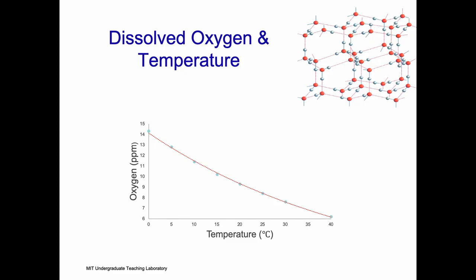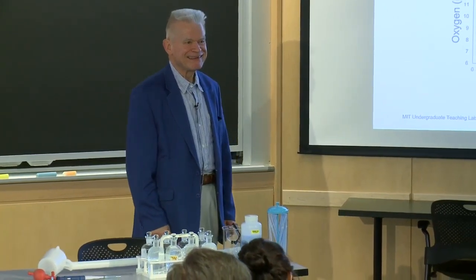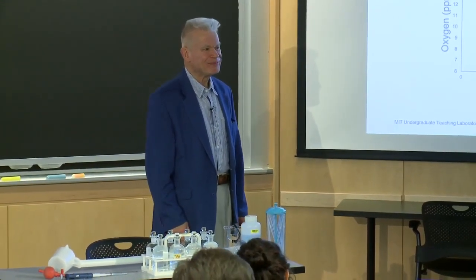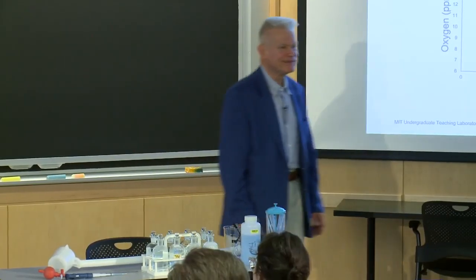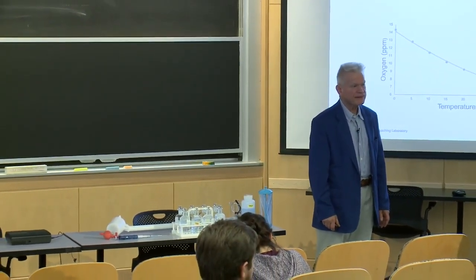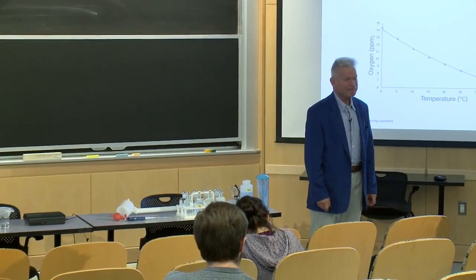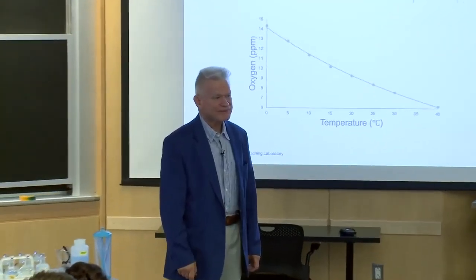Yeah, as the water is warming up, look what's happening to the dissolved oxygen. Why do you think that's happening? And why when the water is cold, can we hold so much oxygen in that cold water? Kelly? Is it because as the temperature increases, the average kinetic energy of the molecules increases and the distribution broadens, so more oxygen has the ability to escape.